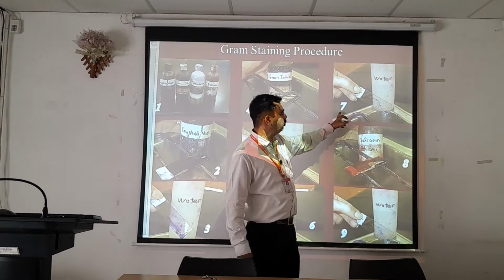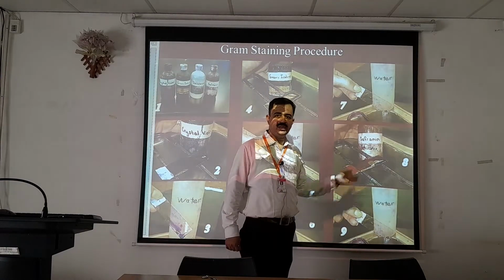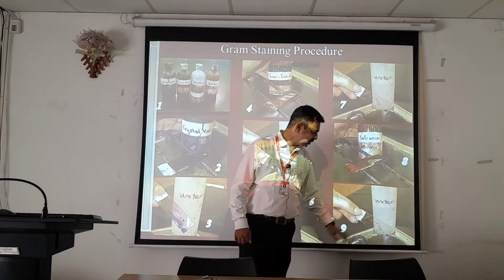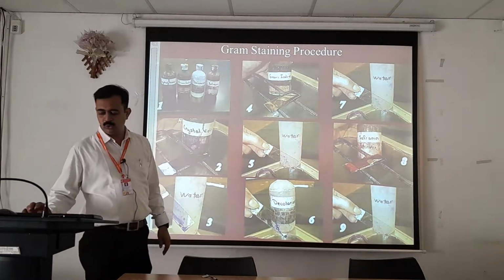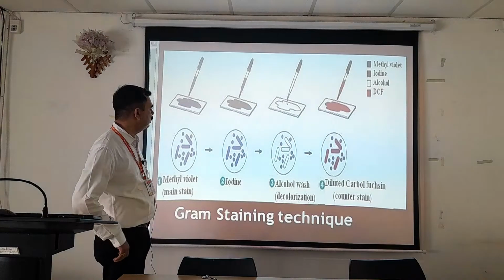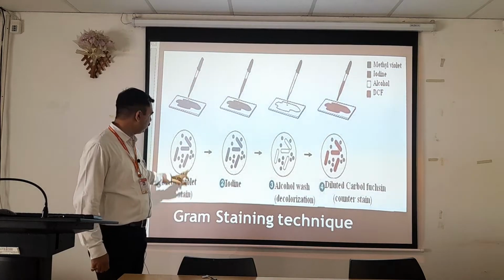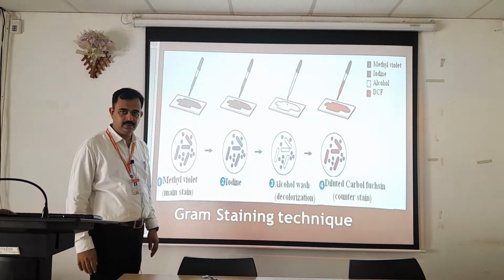Then again it has to be washed with water, very gently. Counter stain with safranin. The secondary stain or counter stain is safranin; you flood the slide, and again wash after a couple of minutes, air dry it, and you will be able to observe. See this. Once we put on crystal violet, all cells which are present will be colored violet.